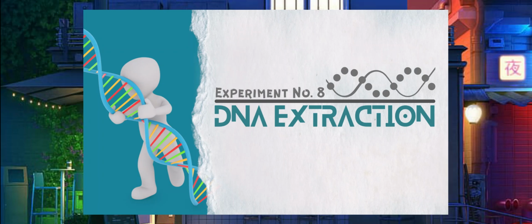I'm Miguel Nismal, and today we will be presenting our eighth experiment titled DNA extraction. Well, I guess you guys already know what we'll be doing from the title alone. So, without further ado, let's get right into it.